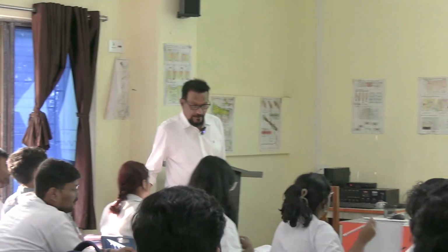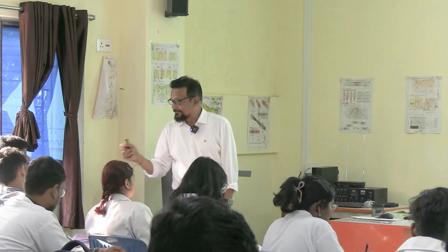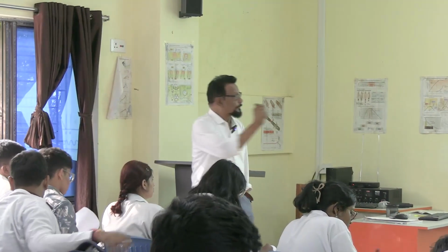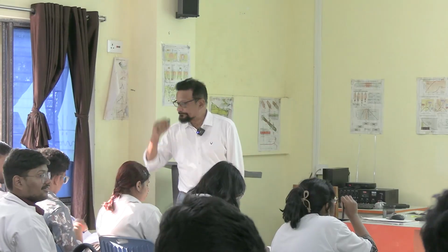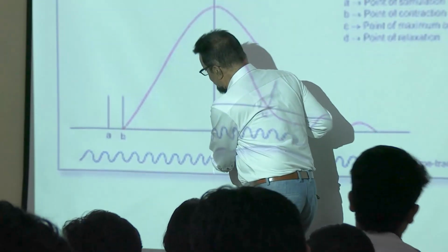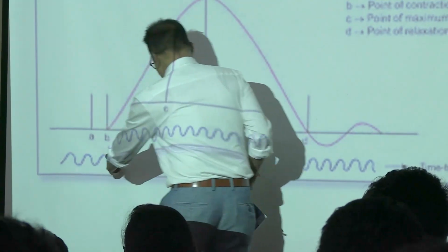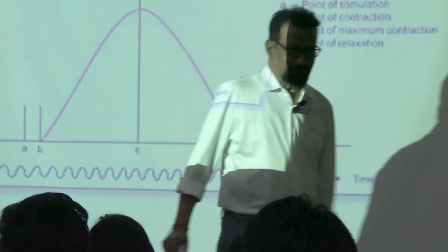Now in your copy, write what the periods are, in seconds. And you know each frequency cycle means 0.01 second. Now you calculate and tell me the results, from this peak. Very easy. Tell your answer.